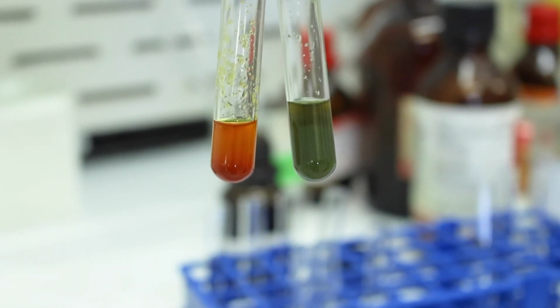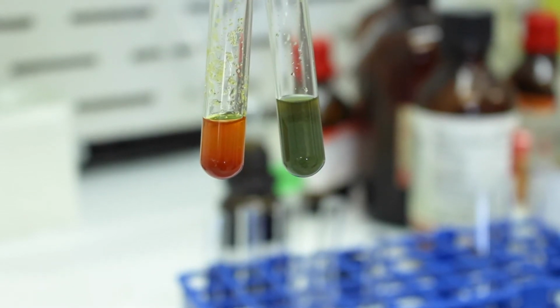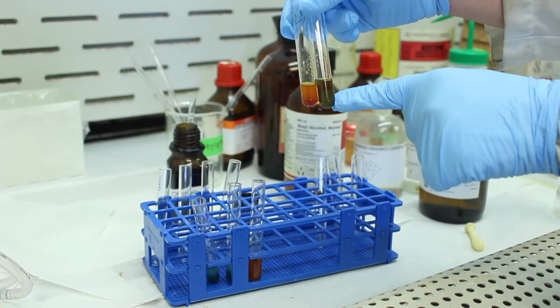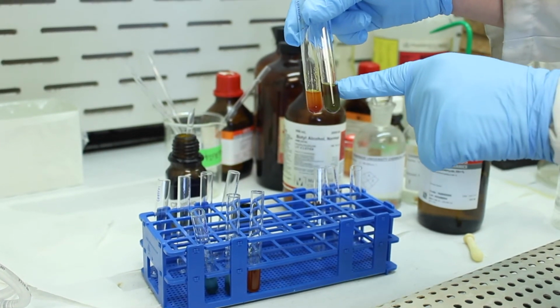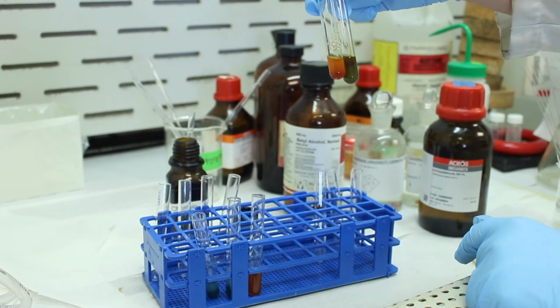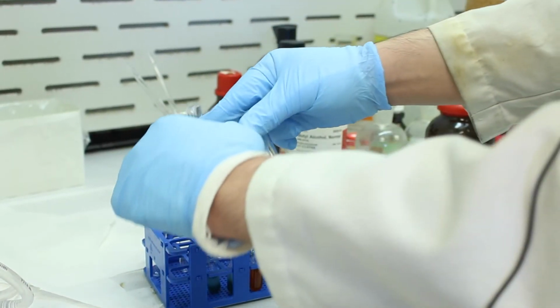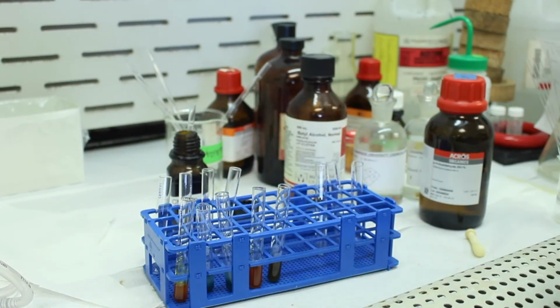But when you hold it next to your control, you can definitely see that there was probably a reaction that took place. So there is some precipitate. It looks a little grayish, bluish green. And the solution above, the supernatant, is a little darker green too. So they just react a little bit slower, but nevertheless, it is still considered a positive test result.